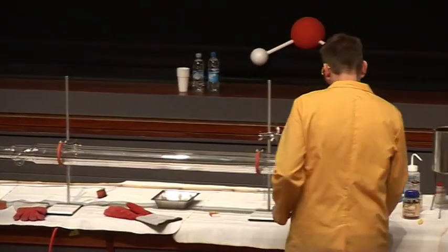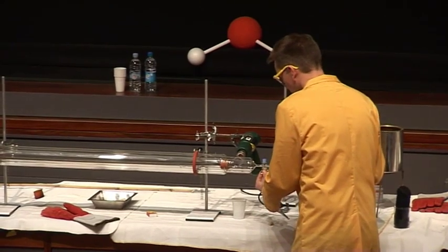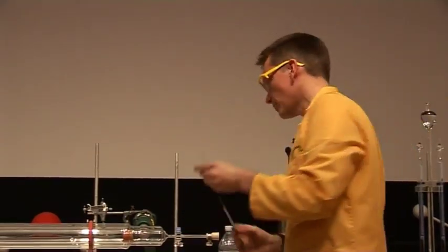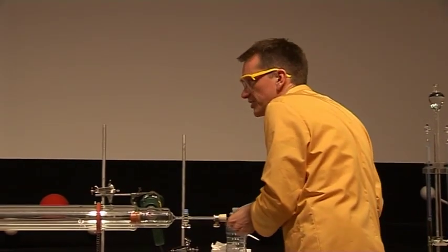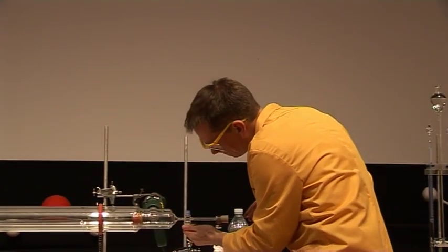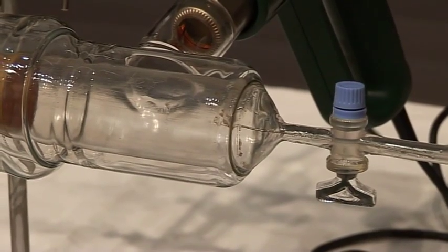Now, you need to watch the dial very carefully. OK, I'm going to inject 1 milliliter of liquid water into the apparatus, and you keep an eye on the dial, because we need to see how many milliliters of steam we get from this. Okay, 1 milliliter about to go in now.